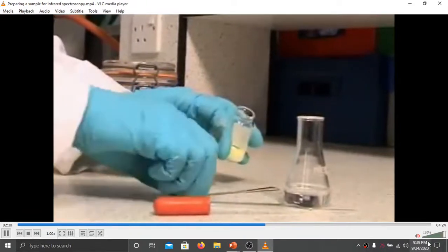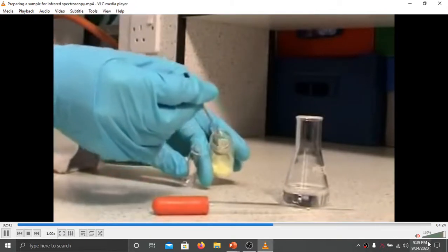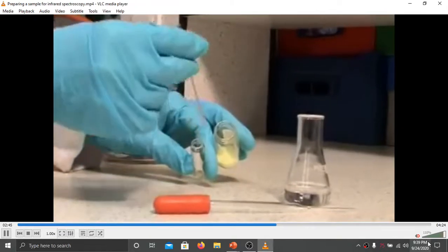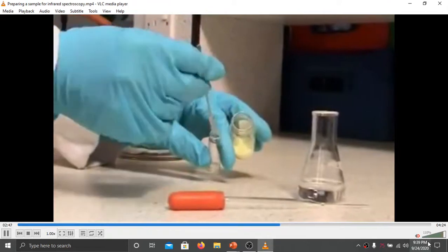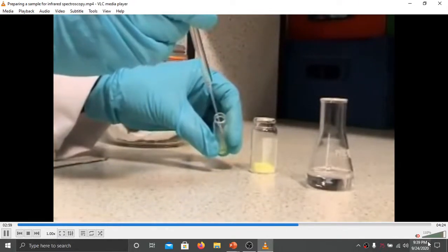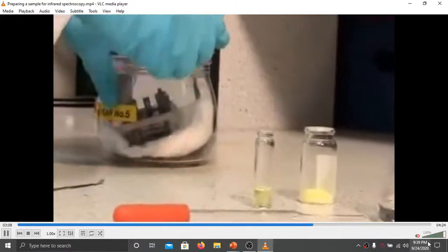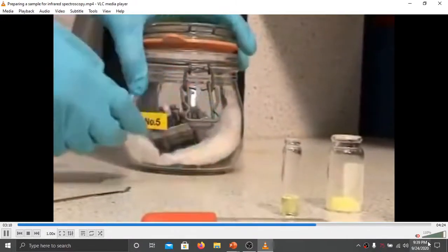Now I will show you the handling of solids by forming solutions. Take a small quantity of the solid material in a small tube. Add a sufficient quantity of solvent like carbon tetrachloride or chloroform, depending upon the solubility of your samples. Use small droppers for adding the liquid. Shake to dissolve. Now I will show you the liquid sample cells.